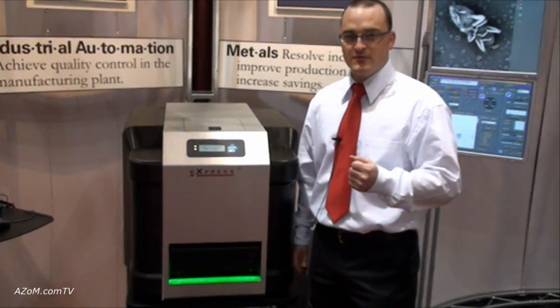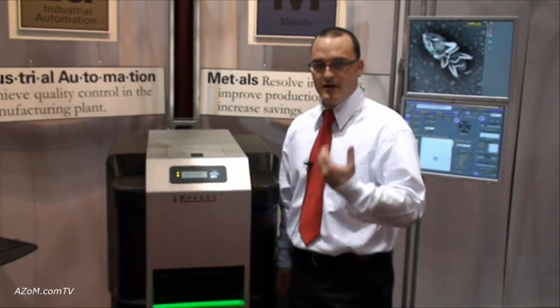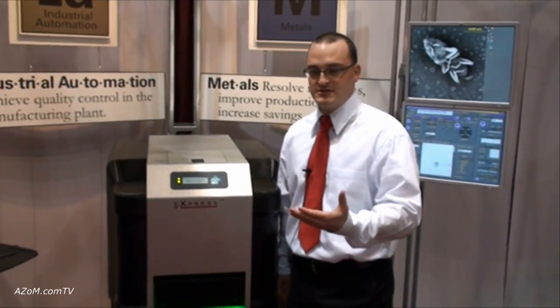It's meant to be used for rapid sample analysis, whether for manual imaging purposes or automated characterization of processes for quality control.